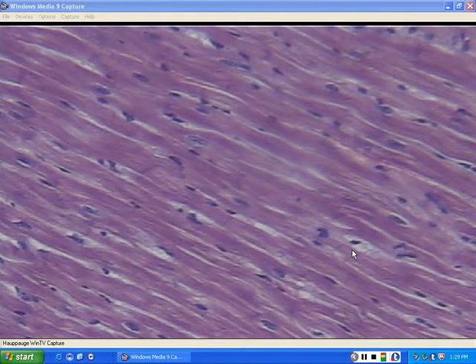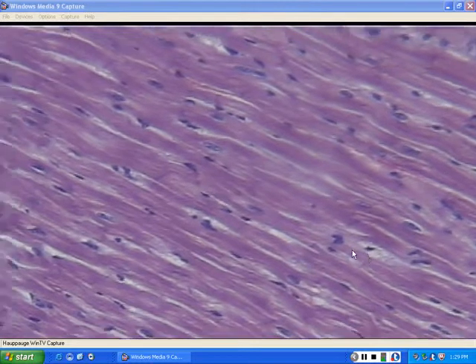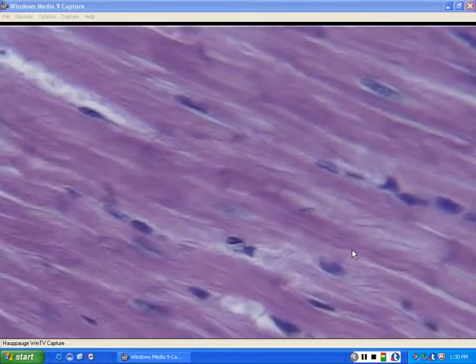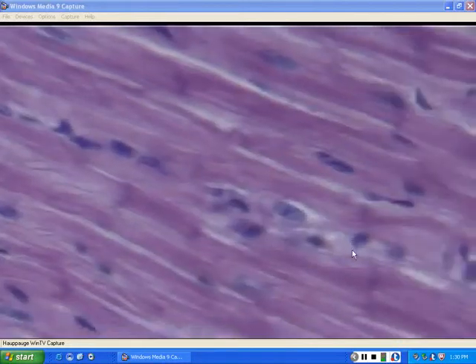One thing you will note about it is that the individual cardiocytes, or heart muscle cells, have a branched appearance to them, and they generally have a single nucleus to each one. And the nuclei aren't on the outside like they appear to be in our muscle fiber from the skeletal muscles. Now, to see the other characteristics of this muscle tissue, we must zoom in, of which there will be other characteristics we can see. One that is generally not as easy to see is that this muscle too is striated, which gives it the ability to do the linear contractions that the heart muscle will do.